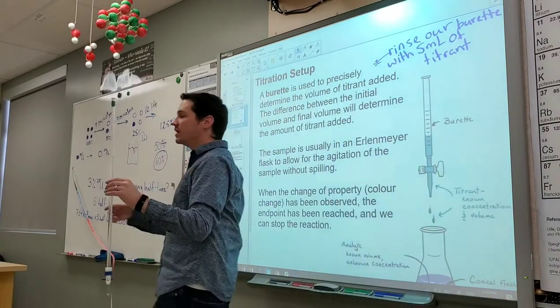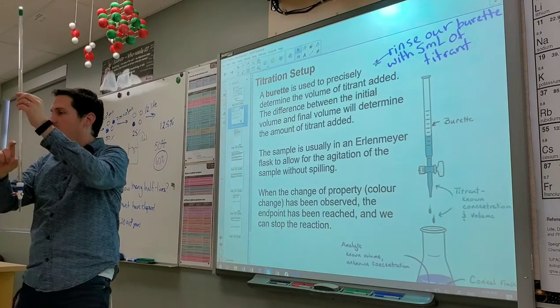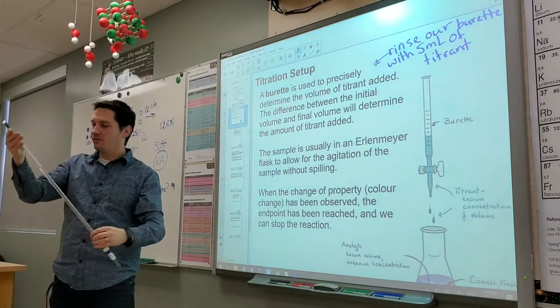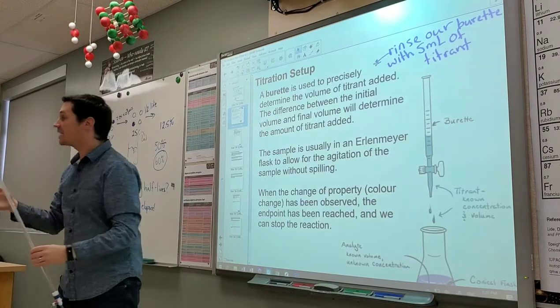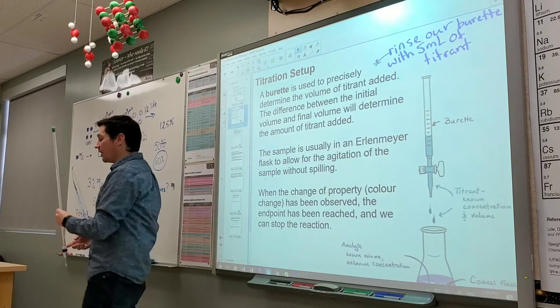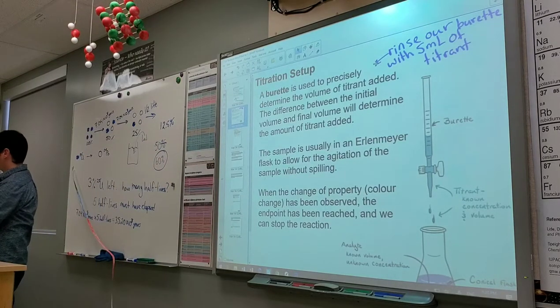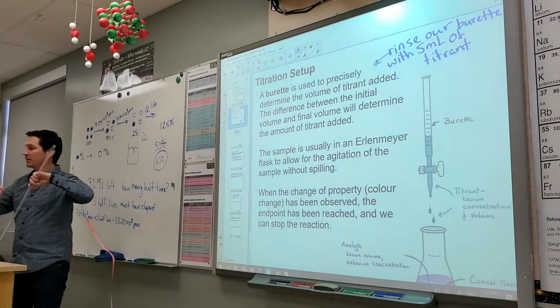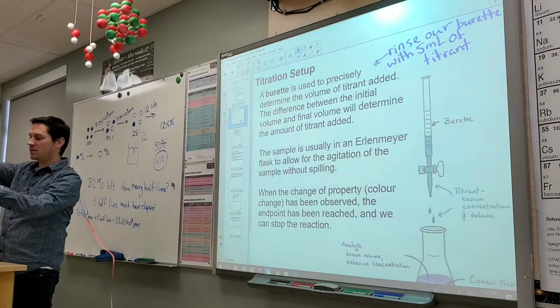So what I should have done is add just a tiny little bit of titrant, and then I could have rinsed the sides of it. I could have reacted all of that extra base that was in there from the last time, and then all I have to do is dump it out into a waste beaker, and now I can properly fill up my burette. Does that make sense? Is that okay?